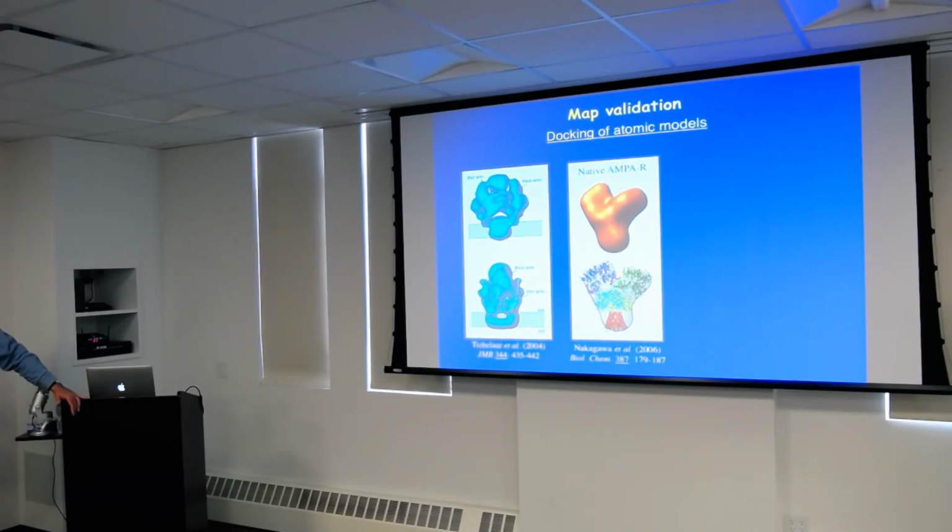So what people now do is they put it into nanodiscs, which are little membrane discs. And then you really can be sure that this looks the same as it is. If you would just remove the detergent, the protein becomes unstable, it aggregates and falls out of solution. So you need something to stabilize the transmembrane domain. So we have to use detergent or nanodisc or something.